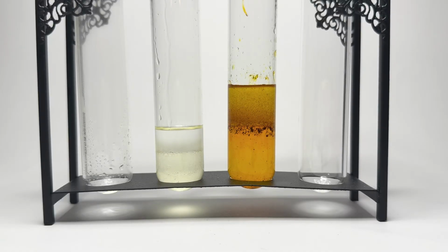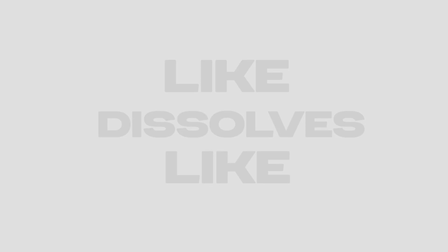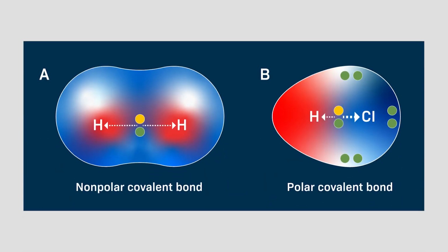So then you know your aqueous layer will have polar molecules and your nonpolar organic layer will have nonpolar molecules. Because remember, the entire principle here is that like dissolves like. So nonpolar things dissolve nonpolar compounds and polar things dissolve polar compounds.